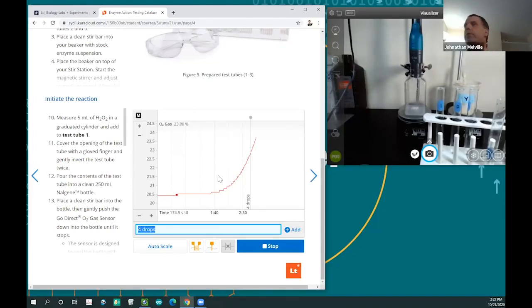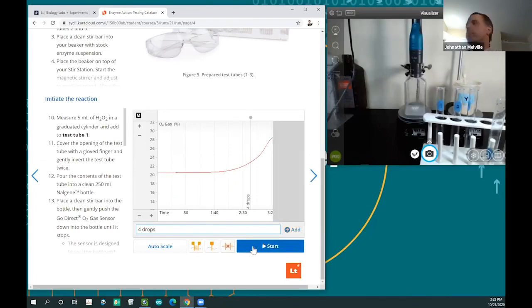There we go. That's beautiful. So now I'm getting a really nice increase in enzyme reaction there. Wonderful. Very nice. What's great is down here, you can see how long we've been recording right down here in this bottom corner. It's almost 200 seconds. I'll let it go a little bit longer. Great. So I'm going to hit stop.